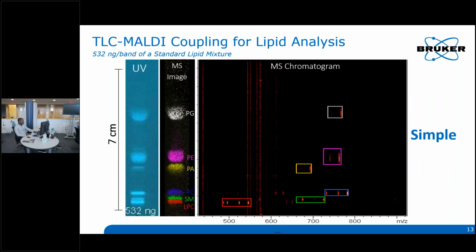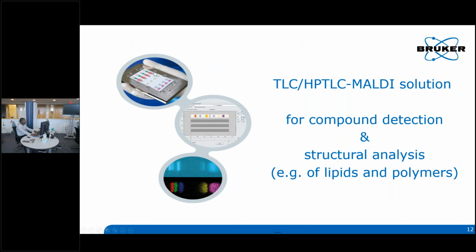a bigger cost. And what we've been able to do is basically couple TLC as a technique to MALDI, where what happens is, as you saw on a previous slide, you can run your TLC separation on a TLC plate, plug it into the TLC adapter target for MALDI, insert it into the instrument, and then image the whole TLC plate pixel by pixel to figure out which components are located where on your TLC plate.